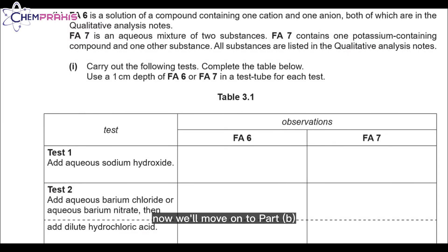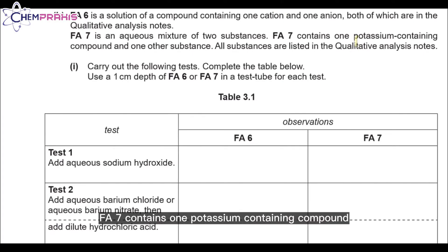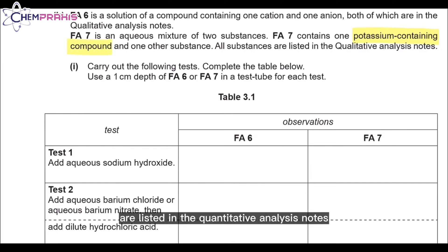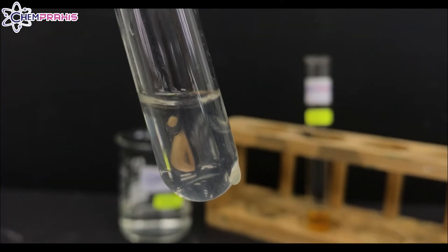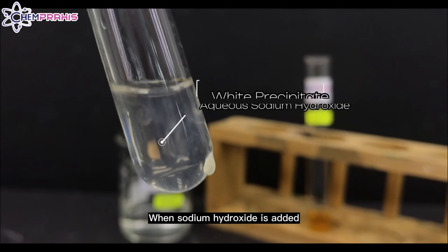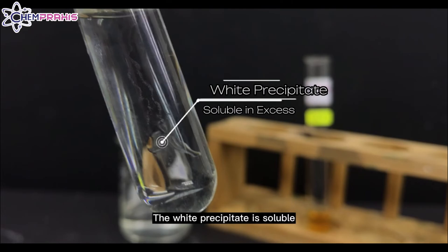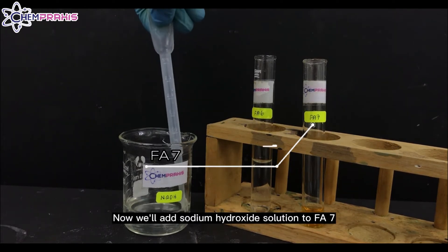Now we'll move on to Part B. FA6 is a solution of a compound containing one cation and one anion, both of which are in the qualitative analysis notes. FA7 is an aqueous mixture of two substances — one potassium-containing compound and one other substance, all listed in the qualitative analysis notes. We'll carry out the following tests and complete the table. First, we'll add sodium hydroxide solution to FA6. When sodium hydroxide is added, a white precipitate forms. The white precipitate is soluble in excess sodium hydroxide solution. Now we'll add sodium hydroxide solution to FA7.